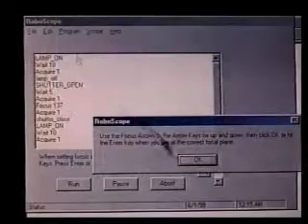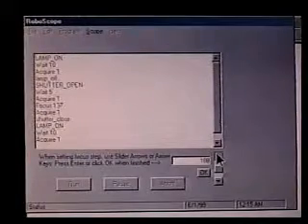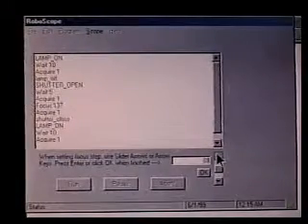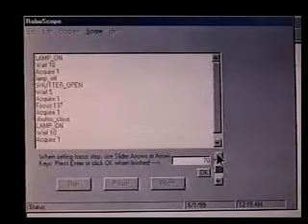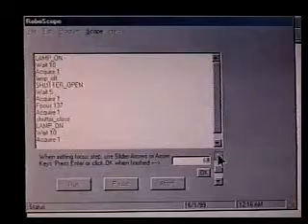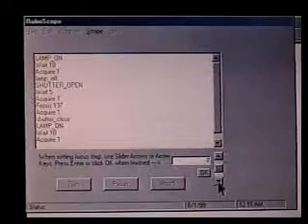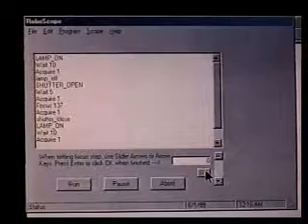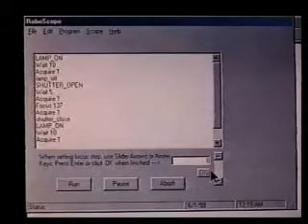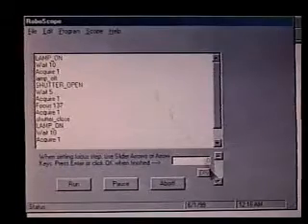Now, we'll focus back to the original plane where we were, and we'll turn the lamp off. Okay. We'll focus back to zero, and we'll turn the lamp off.